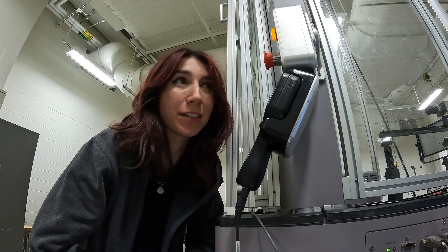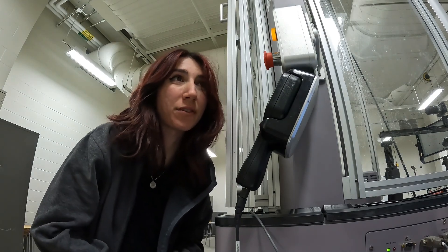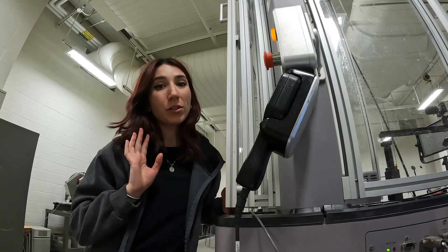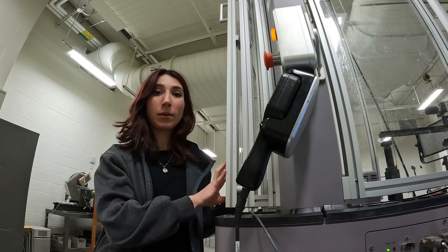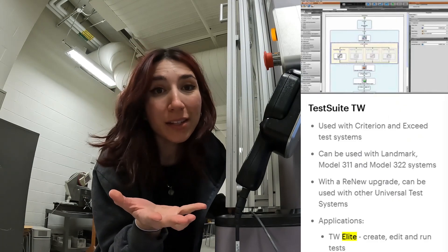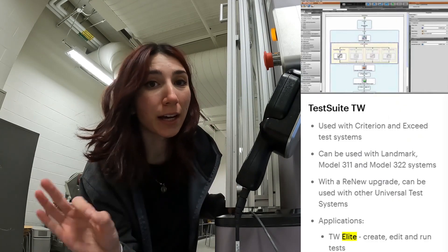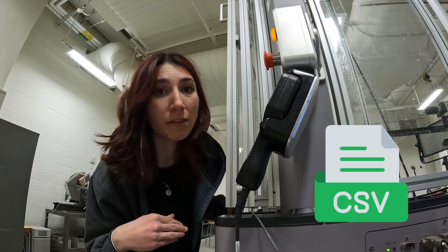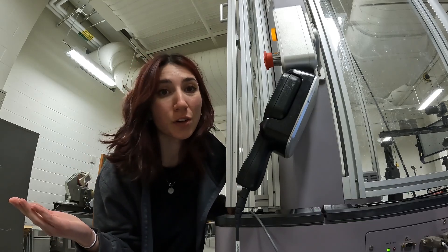Hello, welcome to the Materials Destructive Testing Lab at my university. I have been running a lot of tensile tests today — 63 of them. I'm going to show you how I set up the machine and basically the buttons I click in the software to get my load versus extension curve and export the CSV file. I then convert that to a stress-strain curve.